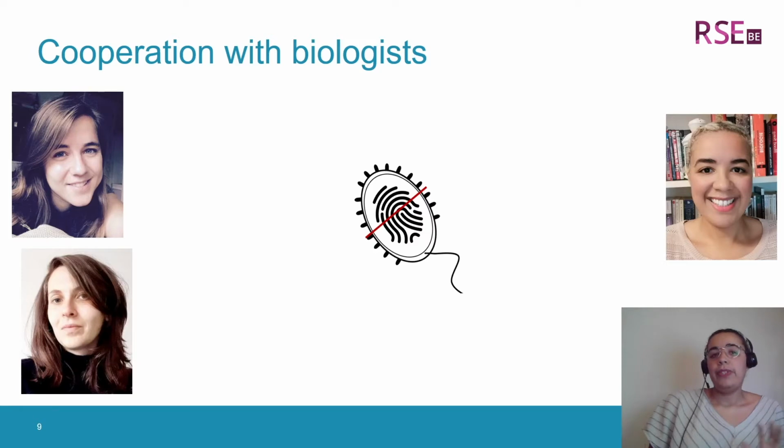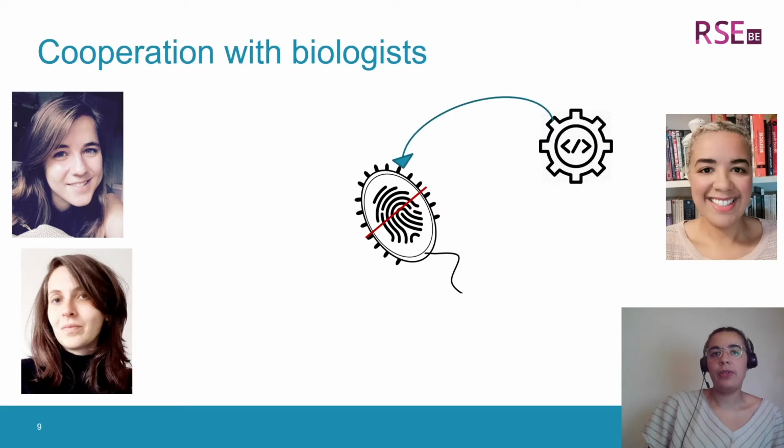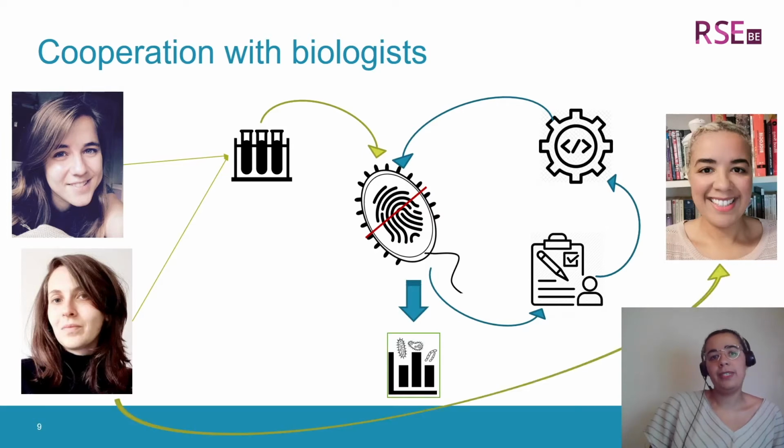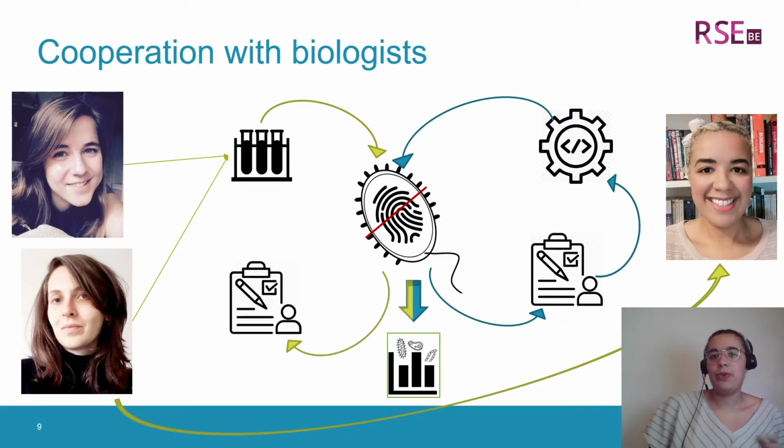We did it during the full tool development because this method was new for us, so we didn't know what we could expect from it. So when I was developing the first aspect of the tool, Charlotte and Anaïs were producing the experimental data to test it. From the test, I improved the function, and from the results obtained, Anaïs and Charlotte were defining more needs for the tool. As soon as an interface was in development, Anaïs and Charlotte were assigned as beta testers, and they applied their data to the tool to test it and formulate requests to me to solve errors and add new functions.